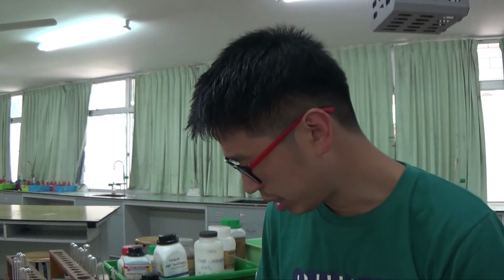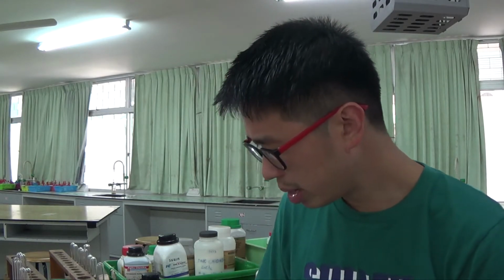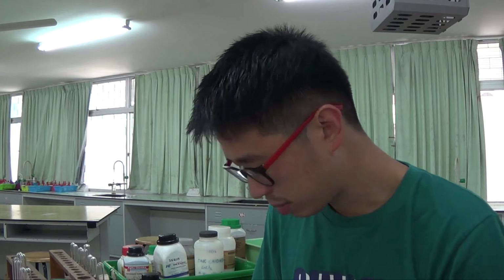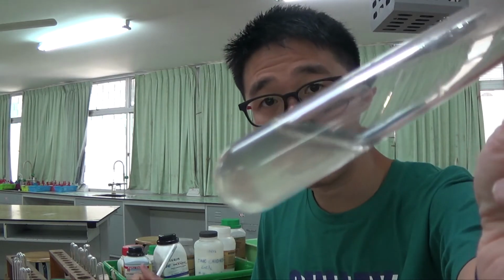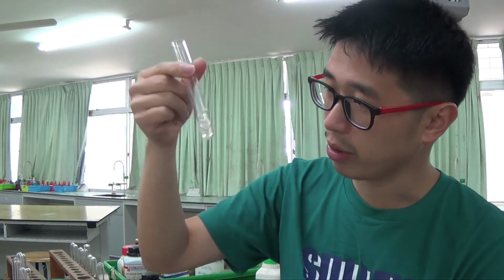Okay, so this is actually supposed to be a little bit pale green. Okay, it's a pale green solution. It's not very clear on the screen, but in my other redox titration video, I have a lot clearer iron 2 salt. This is because there's a lot of ammonium salt dissolved in here as well.